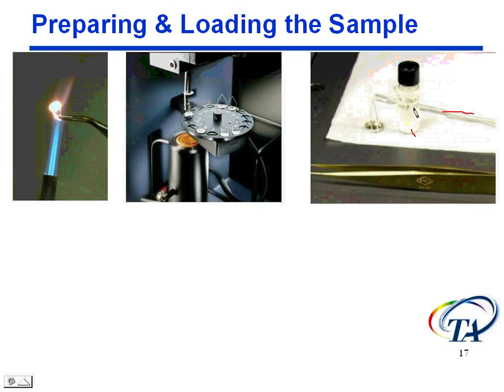We're going to run calcium oxalate. I'm sure you guys have seen calcium oxalate before. It comes in your accessory kit. That's one of the reasons we run it. Everybody can go back and reproduce this experiment.